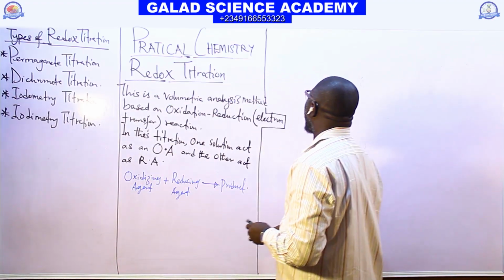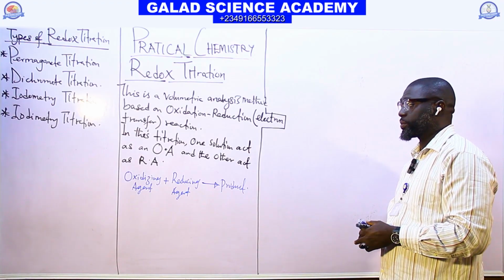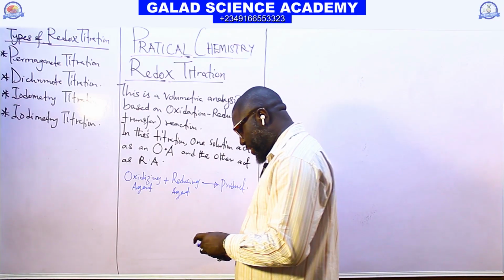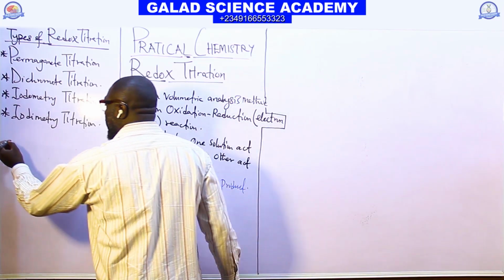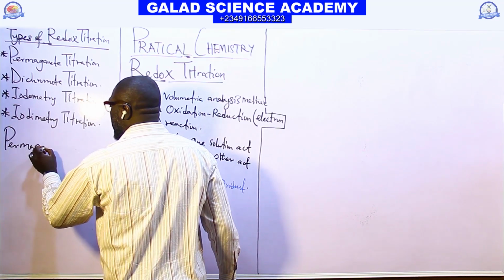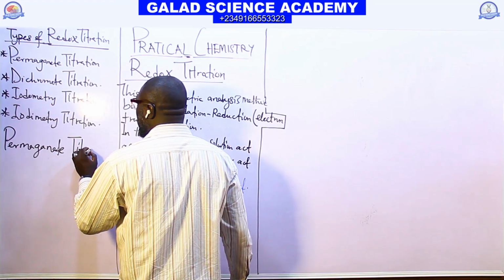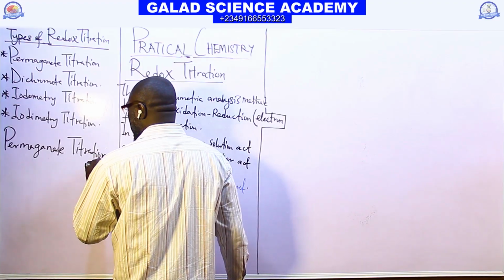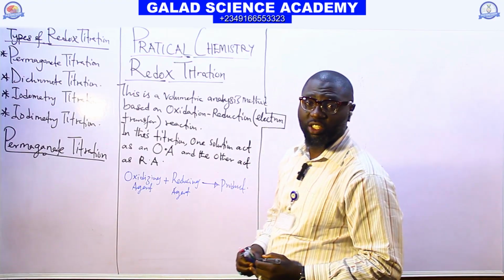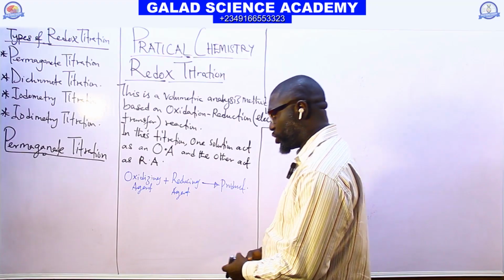So let's take them one after the other. The first one is permanganate titration. You can also call it permanganometry titration.